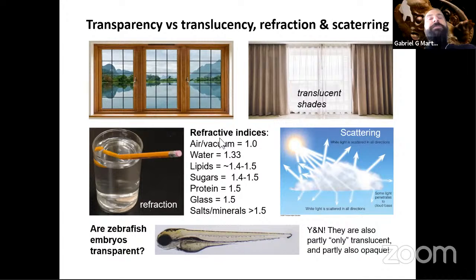The important aspect here is that biological materials have both these properties of being transparent and translucent. And the translucent part is actually the challenging part for us. On an isolated cell that you can take, for example, from your inner cheek and put on the microscope, most of them are very flat and they're actually quite transparent. In fact, so transparent that it's relatively difficult to image them with a simple conventional microscope.